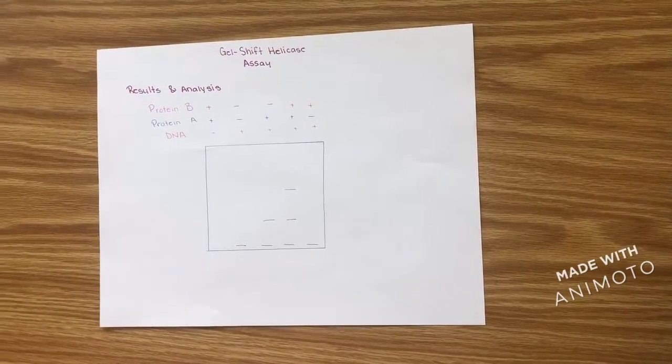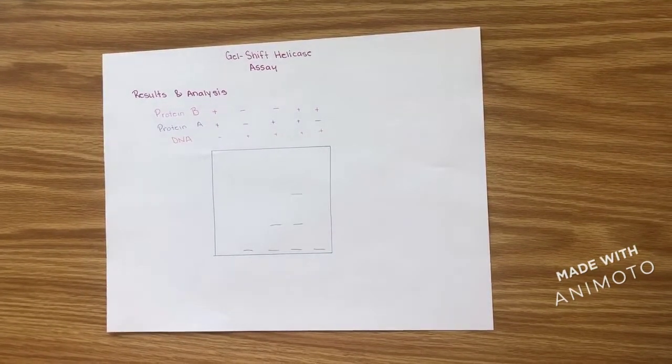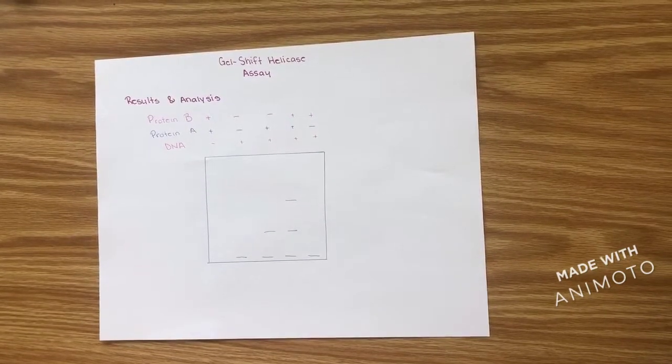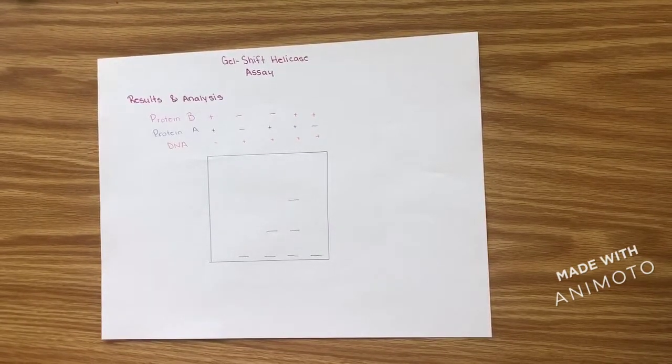The third example is the hardest of them all. There are 5 wells this time. The first well only has protein A and protein B in it. The second well only has DNA in it. The third well has DNA and protein A in it. The fourth well has DNA, protein A, and protein B in it. The fifth well has DNA and protein B in it.